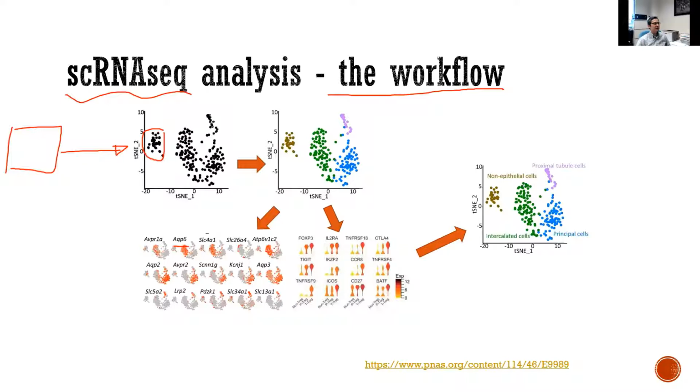So the key step, step 1, starts from the gene expression matrix and uses an embedding algorithm to reduce the dimension and project the cells into this 2-dimensional space. So this lecture will focus on how you are going to do this dimension reduction, how you are going to project them onto this 3 or 2-dimensional space. That's a very basic step, that's step 1 of the analysis.